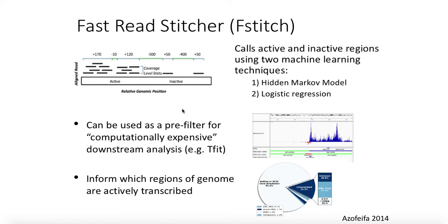You can see on the other hand, on the right-hand side, there's really only 2 reads interspersed over a large region. So this could be due to mapping error. It could just be random reads. RNA polymerase is kind of promiscuous. It binds all over and can transcribe random little elements, even though they don't have any real effect on genomic transcription, or gene transcription, I should say.